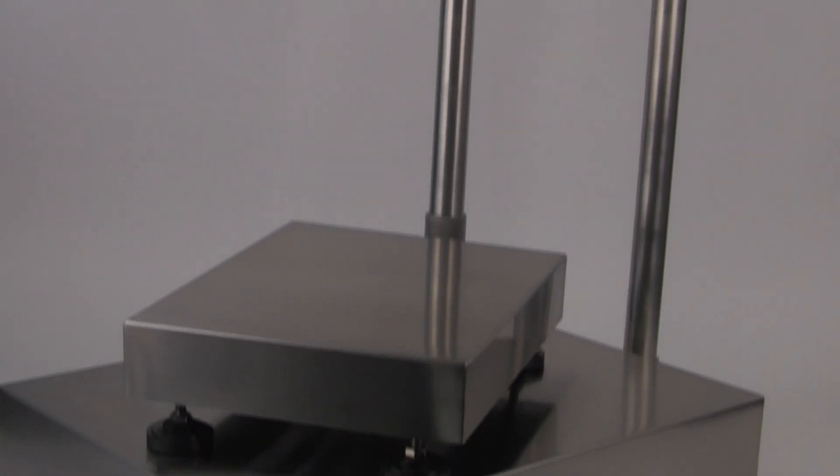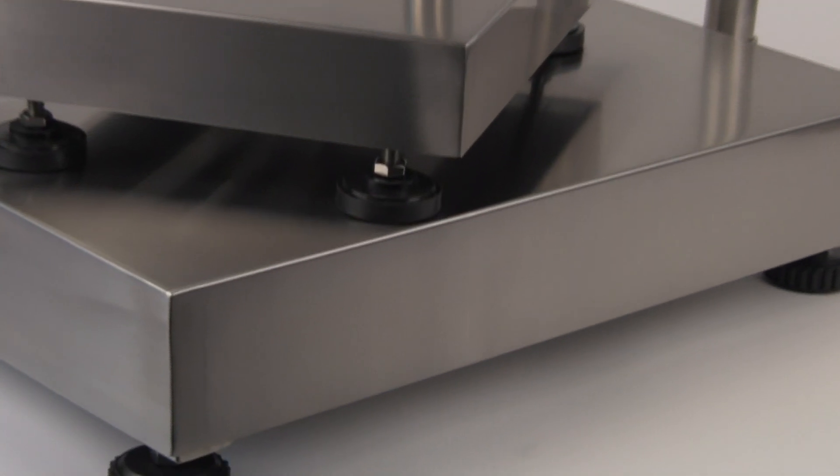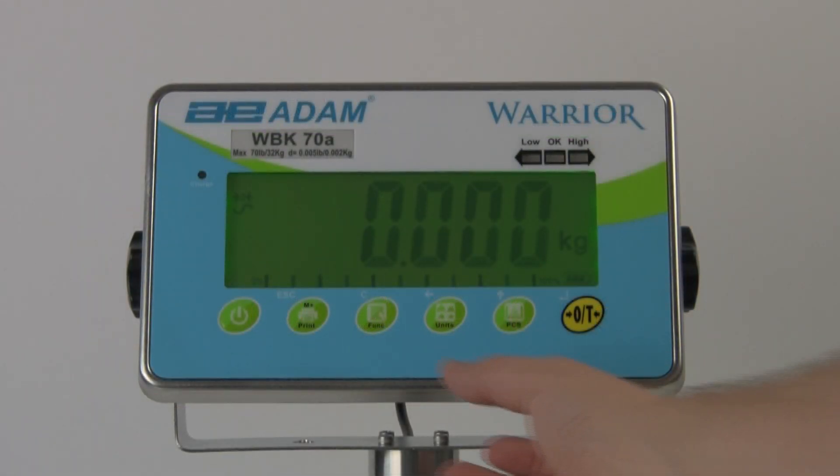Welcome to Adam Equipment's video training series. This video will provide a look at the check weighing function on Warrior scales. Adam's Warrior makes smooth work of weighing repetitive samples. When you need to simply check samples for target weight, the Warrior's check weighing function speeds up the process.